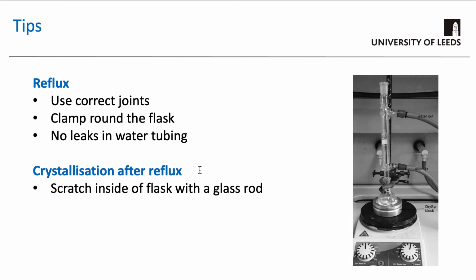The last thing is, after you have done your reaction, you need to cool it back down to room temperature. And what's supposed to happen is the paracetamol is supposed to precipitate out of the water, because it's soluble when it's hot, but it's not very soluble when it's cold. Now sometimes this doesn't happen when you cool the reaction down, but there's a trick that you can do to help the crystals form.